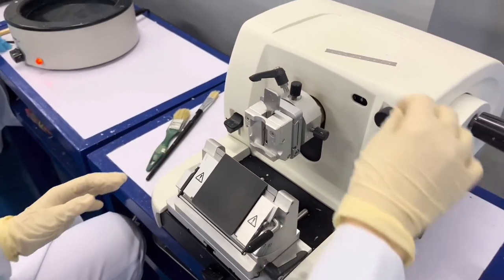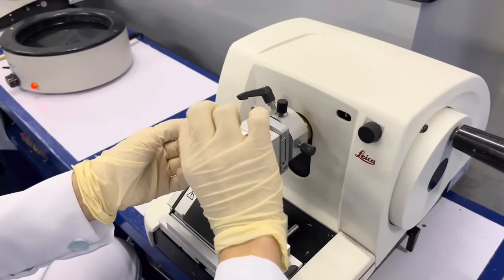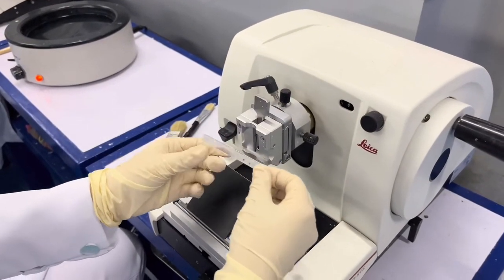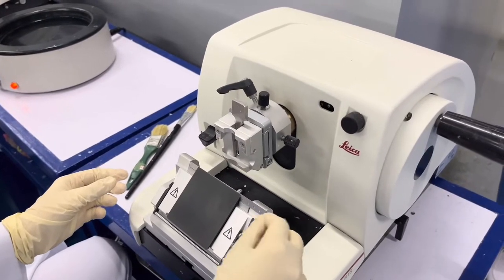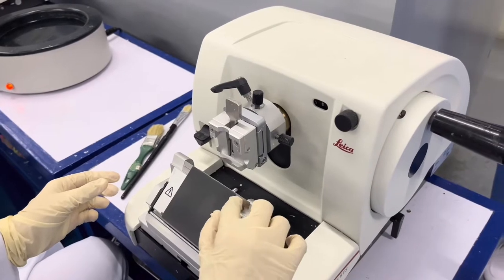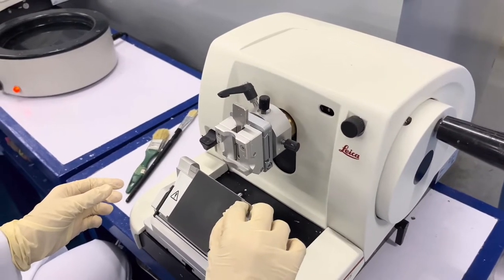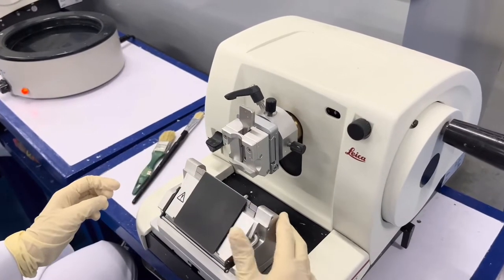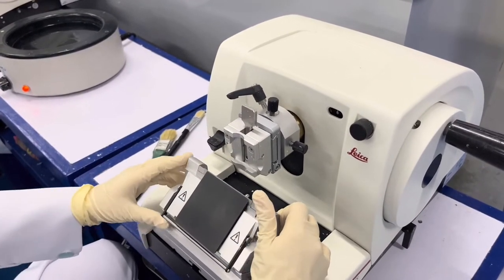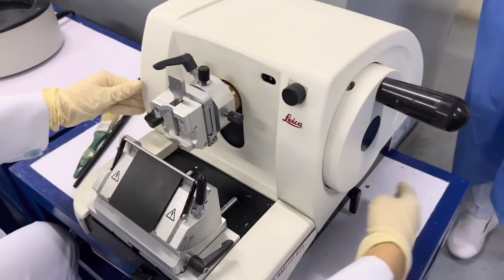Lock the blade holder base using the lever by turning it away from you. Carefully get the blade and insert it into the blade holder. Make sure to lock it using the lever by turning away from you. Also, do not forget to put the guard to prevent any cutting incidents.